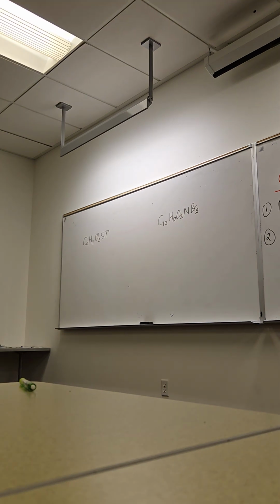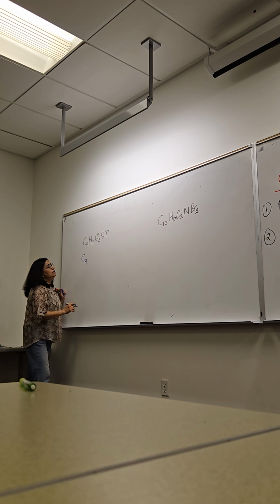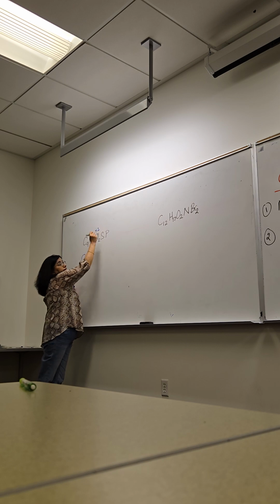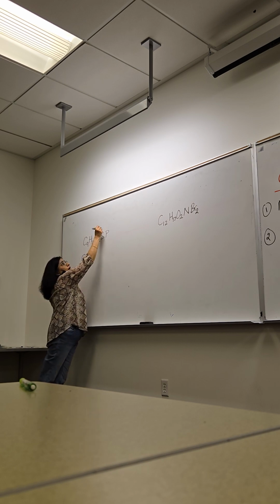Modify the formula, right? Okay. So, how do we modify this formula? C9. What do we do for each halogen? Drop it out and then add 2 hydrogens. Plus 2, right? Yep. What do we do for sulfur? Just drop it. Just drop it, no adding.